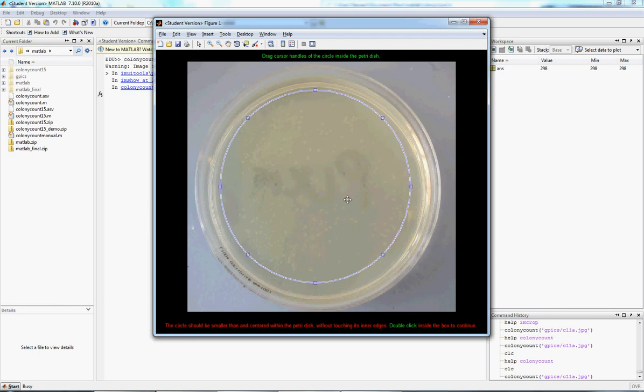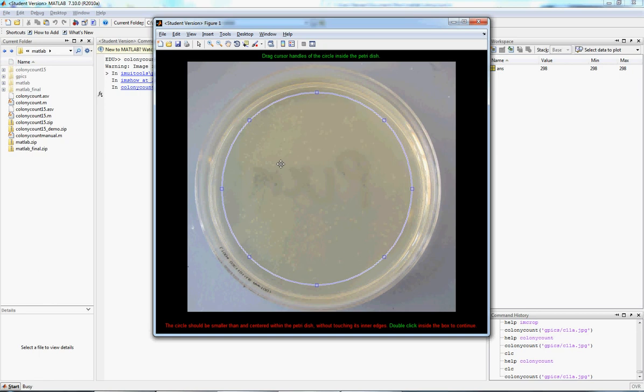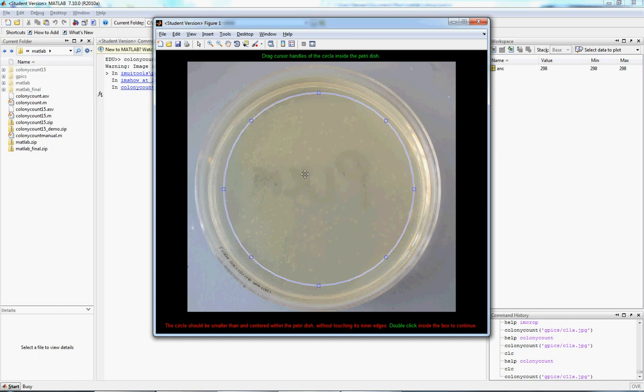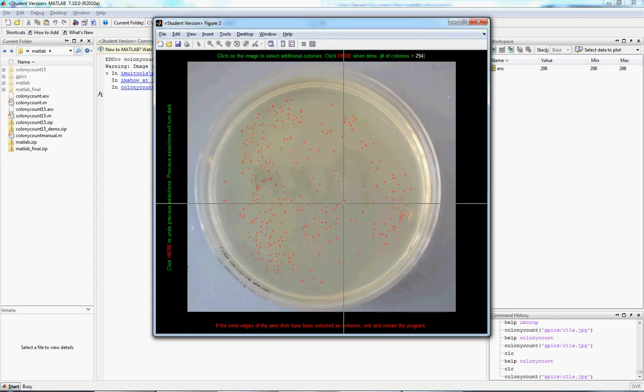You want to make the circle by dragging it. Again, we can move it around and resize it. You want to make sure that you don't overlap any of the edges over here, because that's going to then get counted as a colony. It's okay if there's a few things on the outside. We can add those later. And then, once we think we're just about good, go ahead and double-click inside.